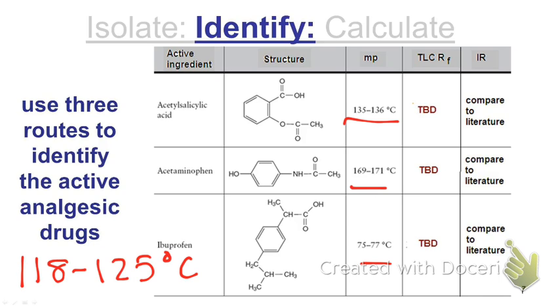What do you think your compound is? Could it possibly be ibuprofen? Why not? It's too high, so we could cross that one off our list. Okay? Could it be acetaminophen?